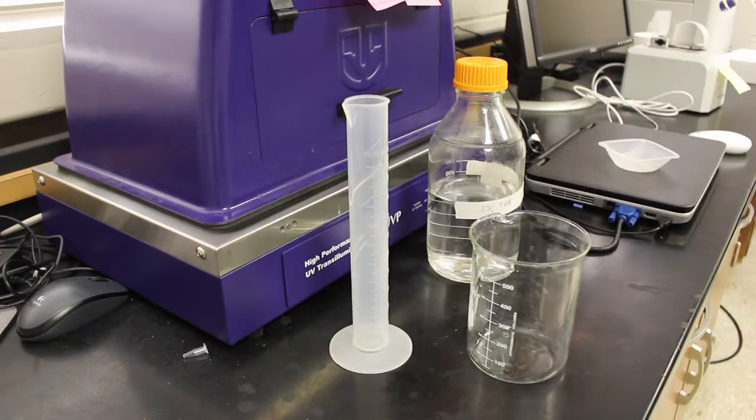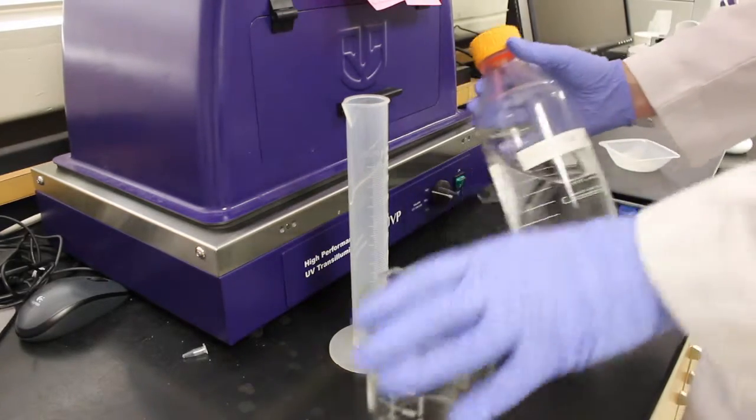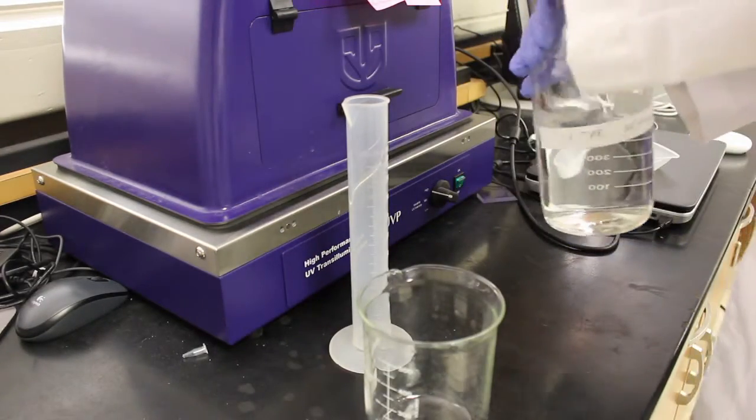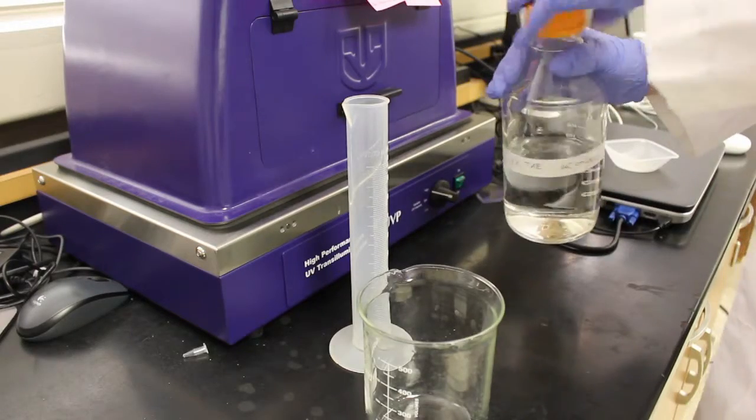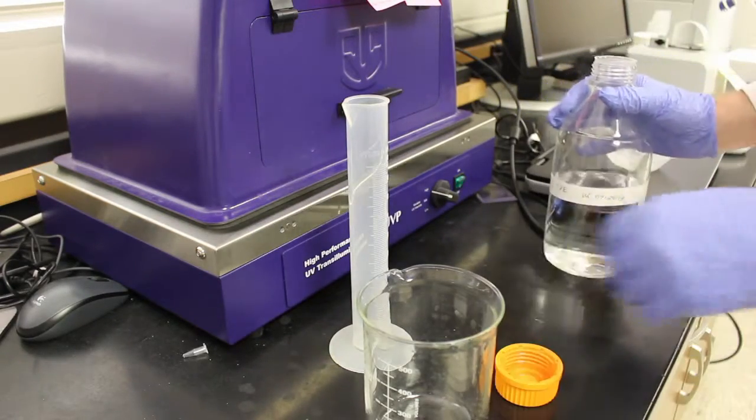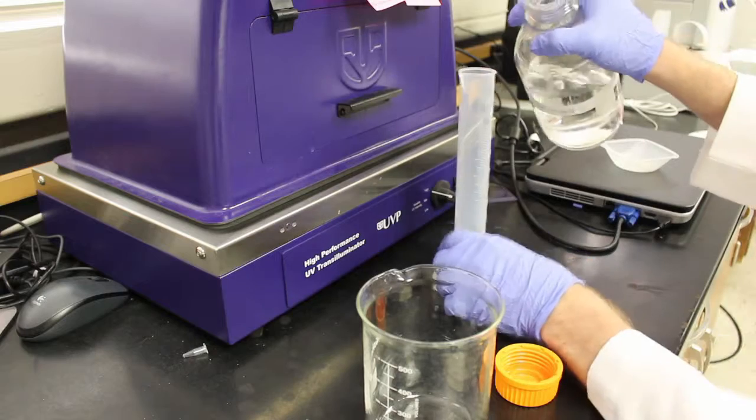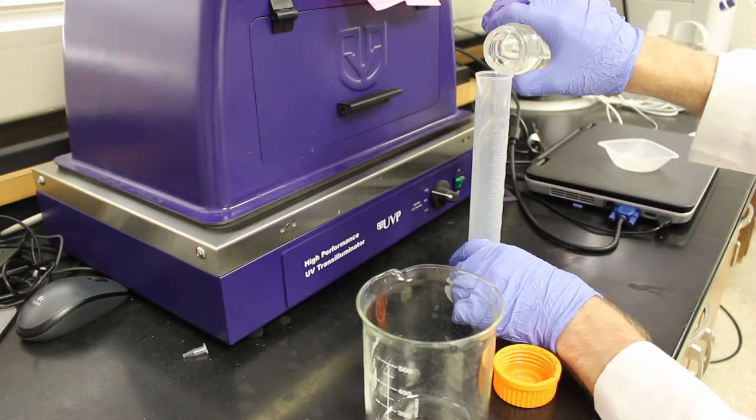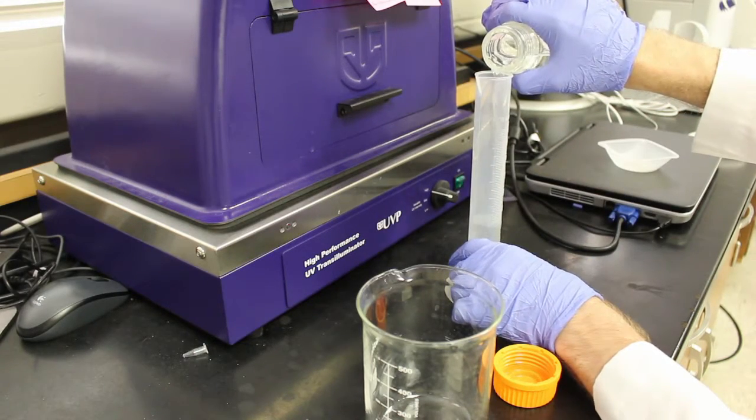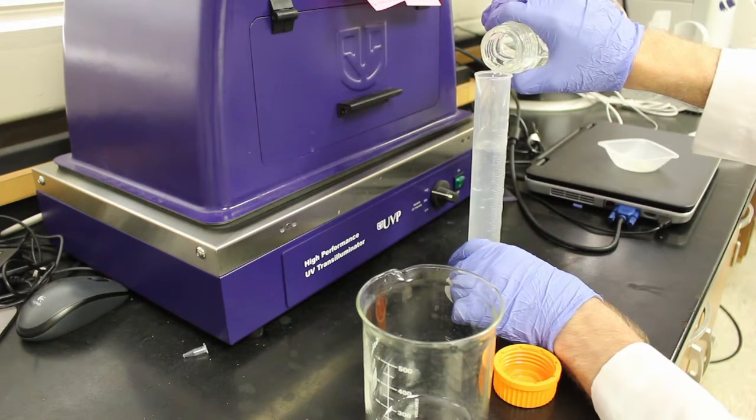In addition to agarose, we'll be using 100 milliliters 1X TAE buffer as a solvent. TAE contains a mixture of tris base, acetic acid, and EDTA. Together, these compounds allow electrical conduction and prevent ions from interacting with DNA samples. Other buffers, such as TBE, can be used as well depending on the application.